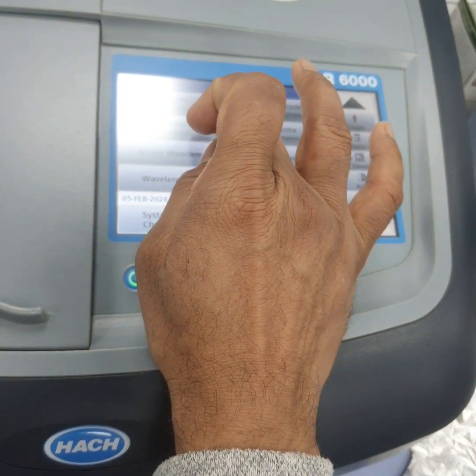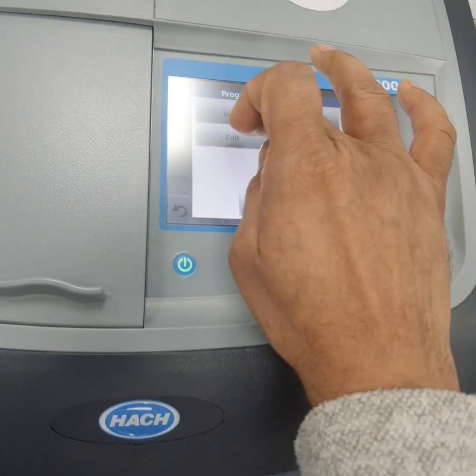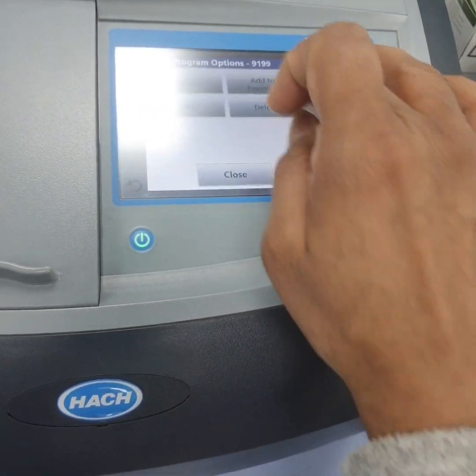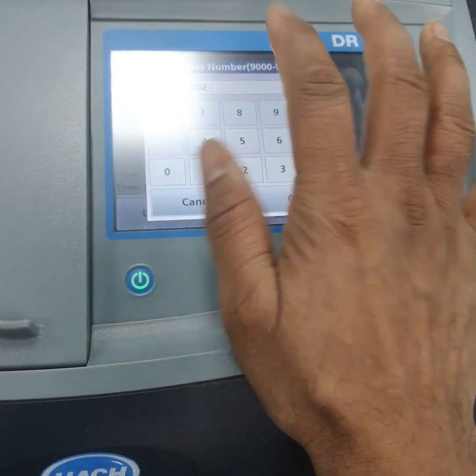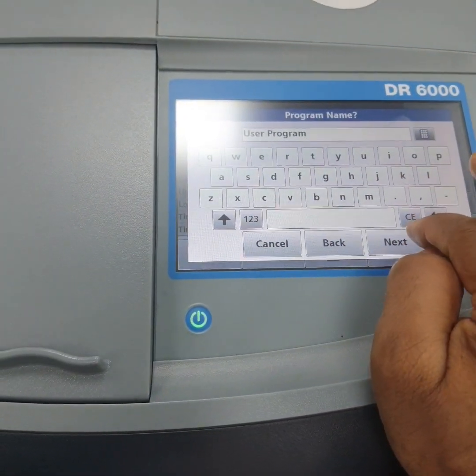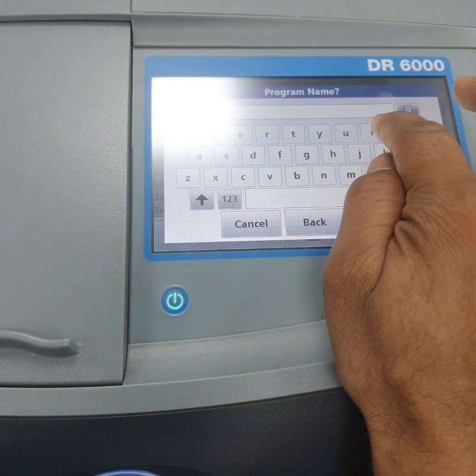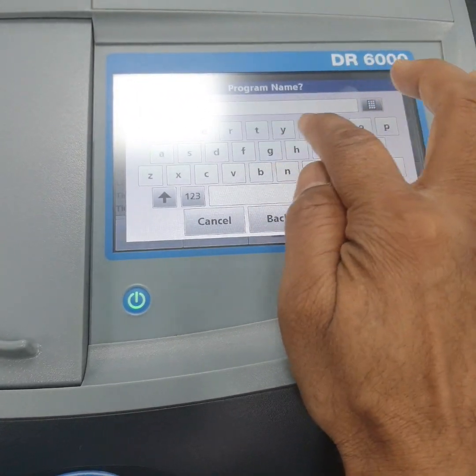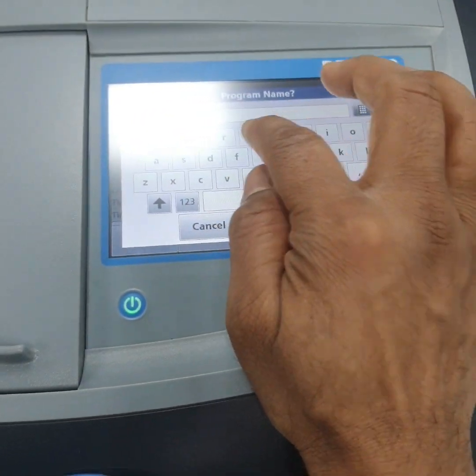For making the calibration, we go here and select program options and then edit. Sorry, not this one. Program options and new. This is a program number, leave it, and then type here, let's suppose, Congo Red.